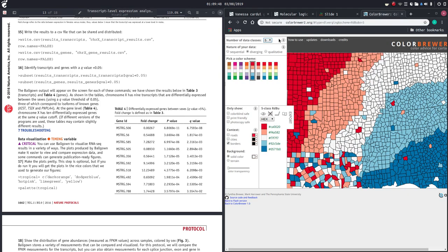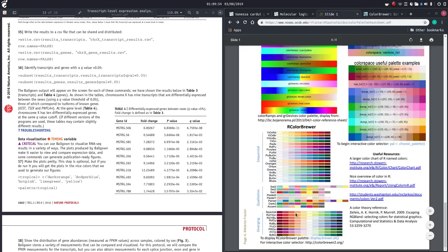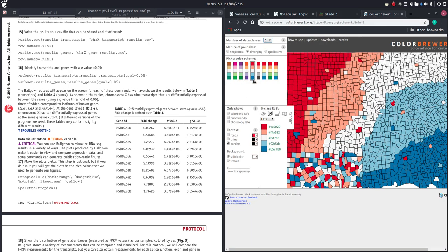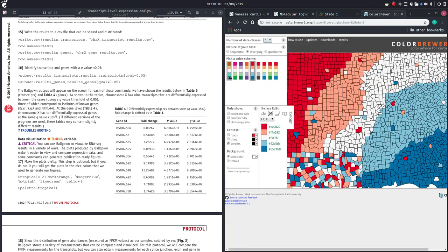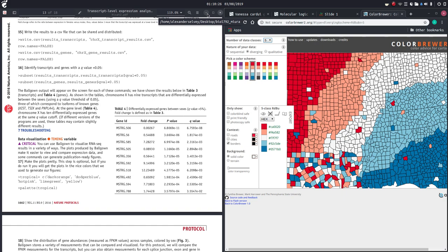I came to the color brewer website, set the number of data classes to five, selected the diverging section because that's where RdBu was, and selected RdBu — that's the fifth one. These are the colors it spits out: red, salmon or peach, white, light blue, dark blue. We'll see what happens when we make our plots and what colors come up. So that's our color brewer — brewer.pal set to five, using the RdBu palette.